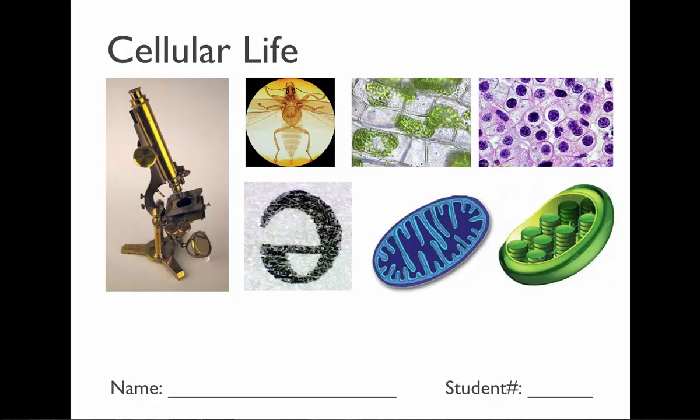So this entire unit is about cells, really. But before we can get into cells, we need to focus on the microscope a little bit. So we start off this unit with a little discussion of different types of microscopes and how we use the microscope. Then we'll do some practice, do some labs. Then we'll move into cells, talk about cells, look at cells under the microscope, and so forth.